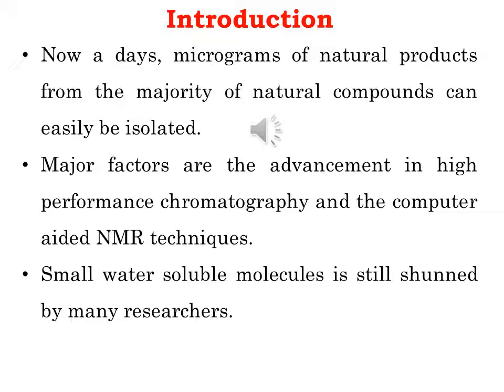About 10 years ago, some authors wrote a guide for the purification of marine natural products with the emphasis on water-soluble compounds. So in this lecture, we are going to discuss the general procedure that can be used for the extraction or purification of water-soluble small molecules.